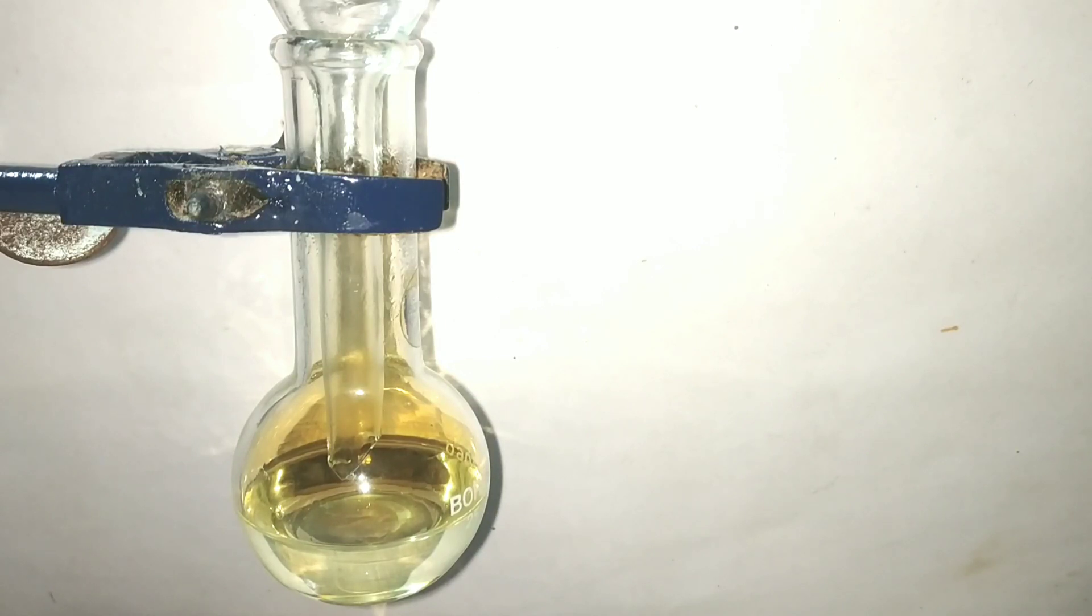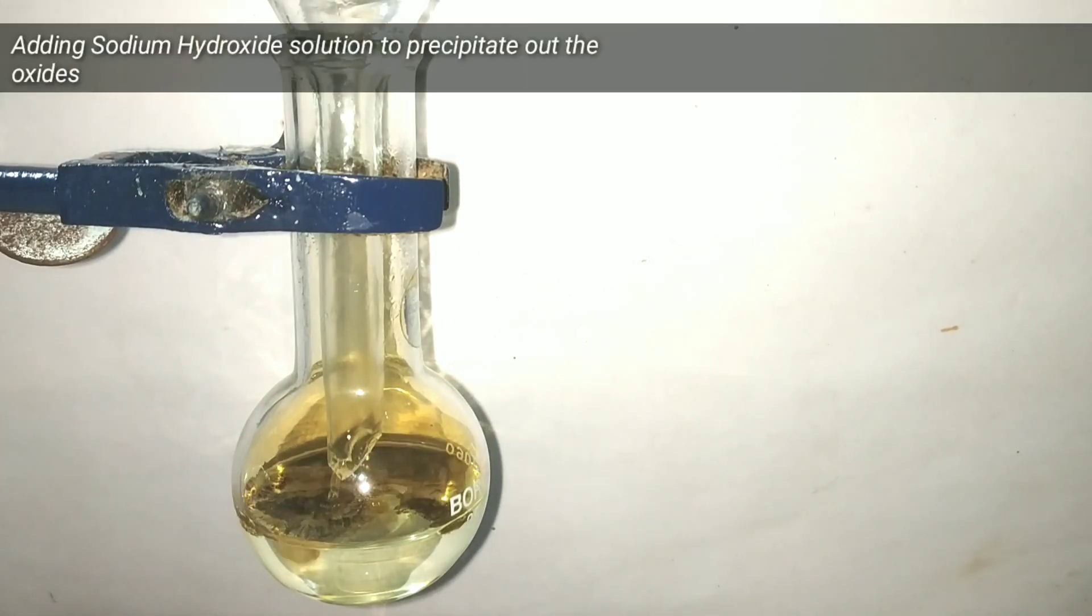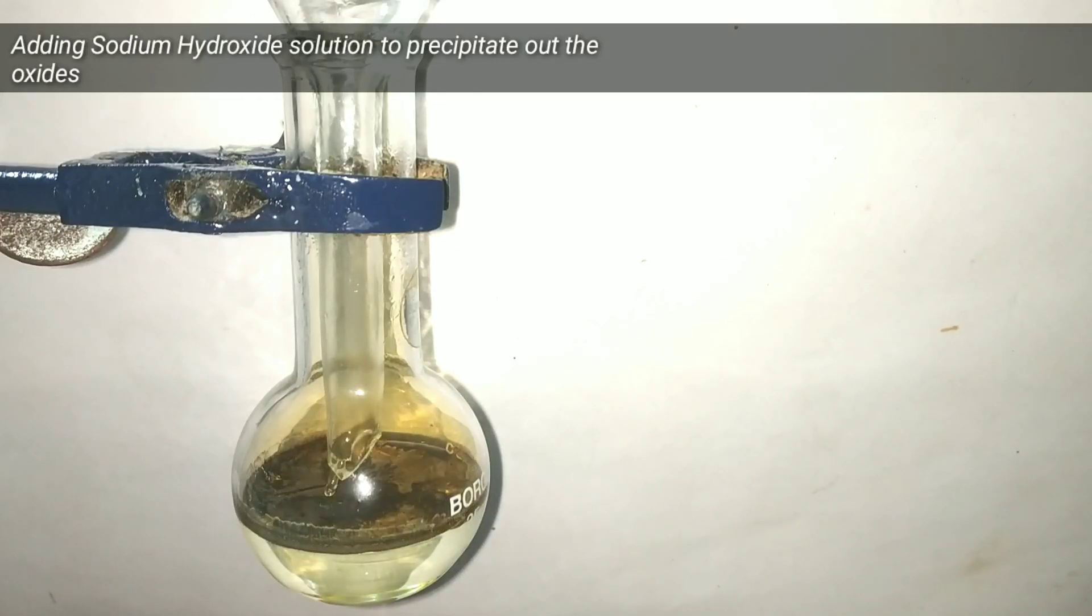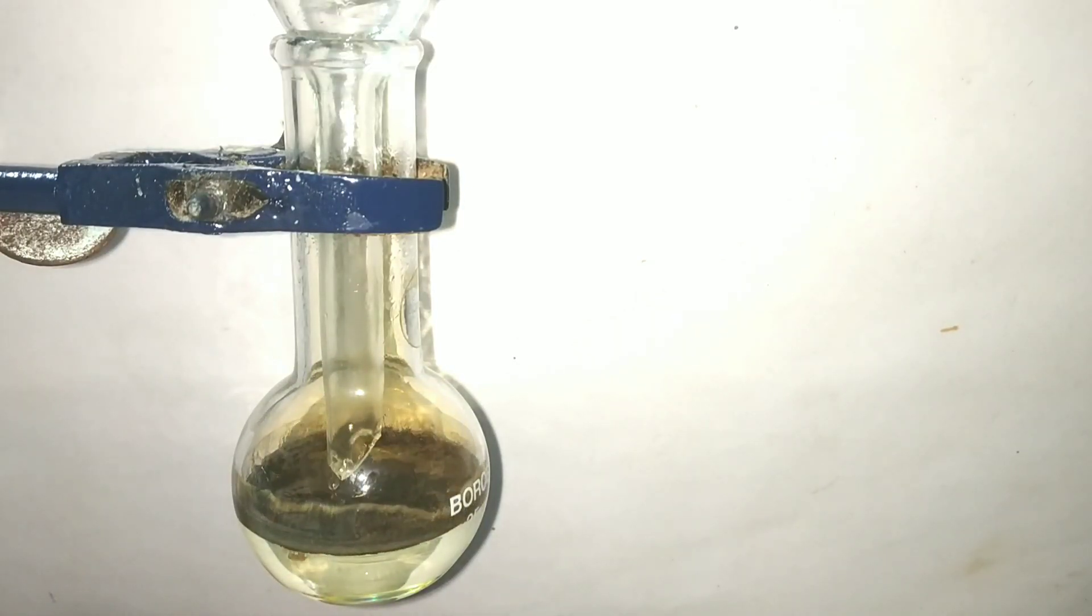When all the mercury metal has dissolved and when the solution turns clear, we add sodium hydroxide. You can see that a grayish precipitate is formed. This is the mercury 1 oxide. There was yellow to orange precipitate of mercury 2 also formed.